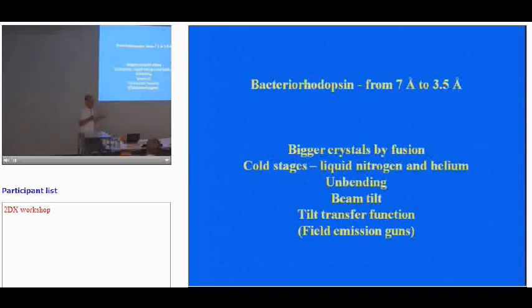But I have an equal number of slides that's supposed to give you a feeling for things and not too taxing intellectually. So I'll just carry on with it. So this is what was it that allowed us to go from sort of lowest resolution, where we weren't doing unbending, we weren't doing beam tilt correction, we weren't doing lots of other things.